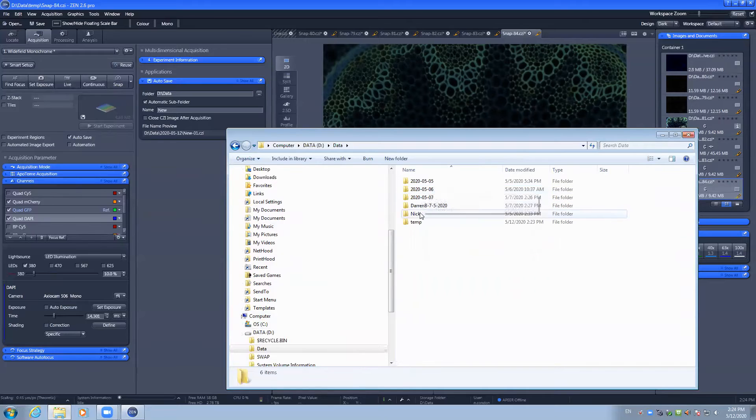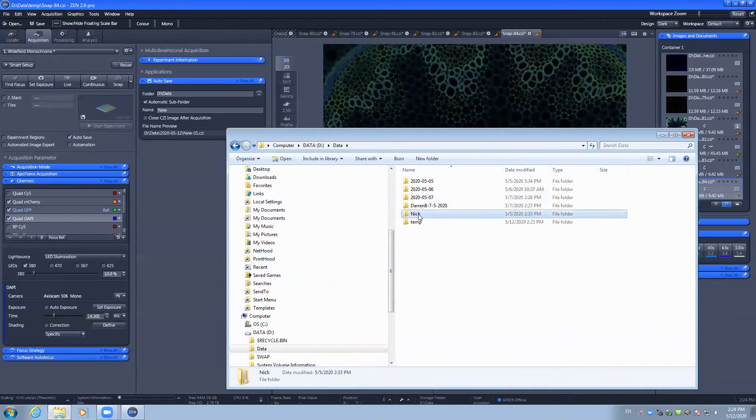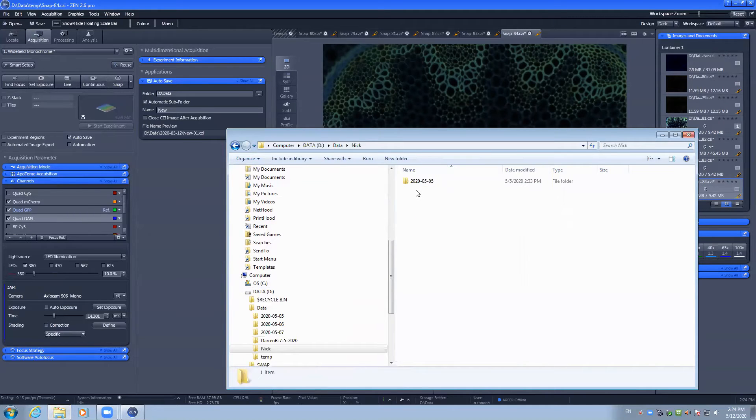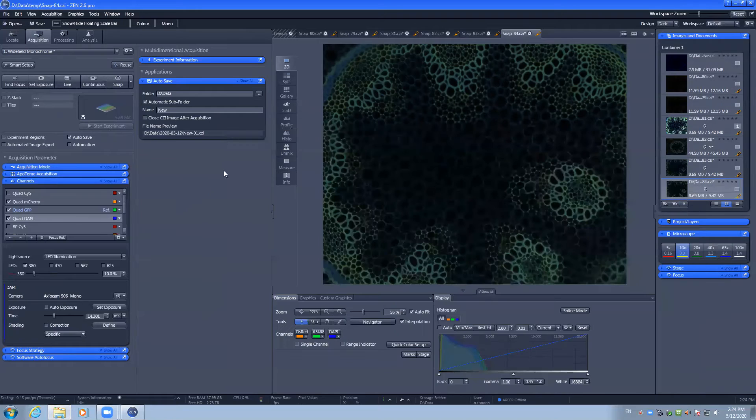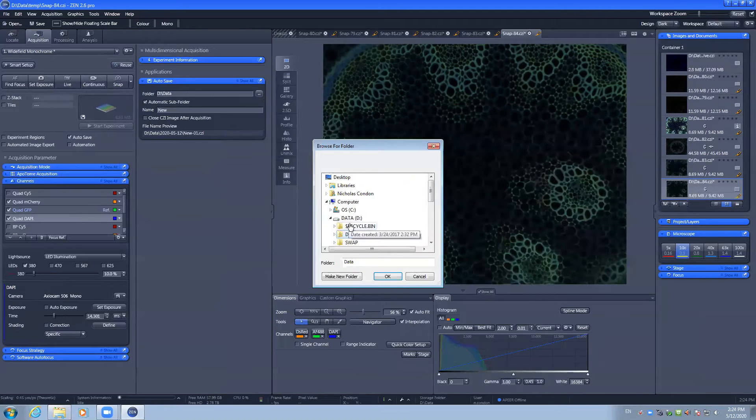You can create a folder with your name and this should be where you save your data during the imaging session. In the autosave, you want to point to that folder.